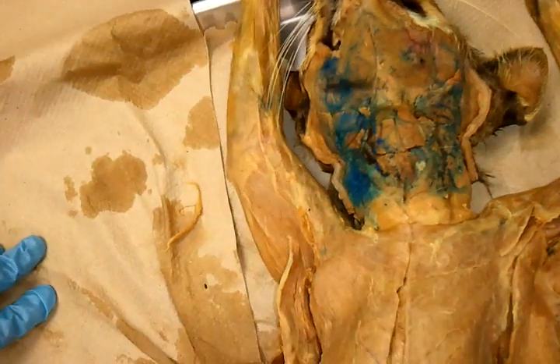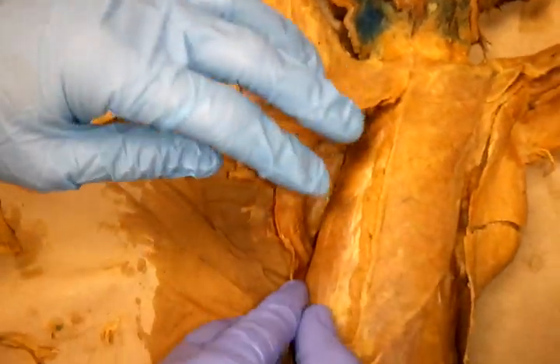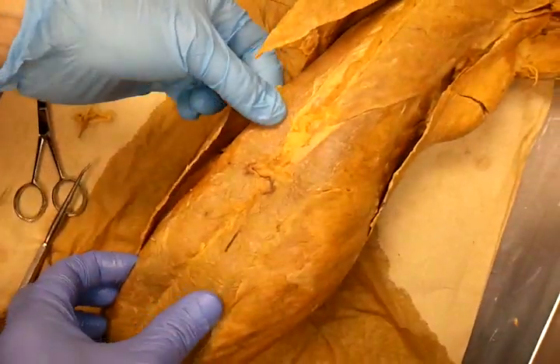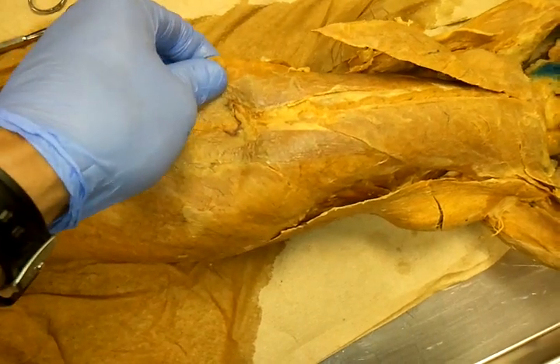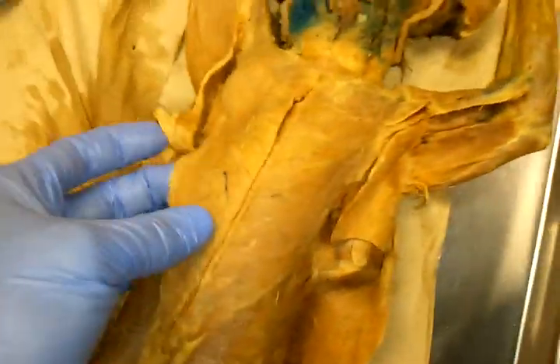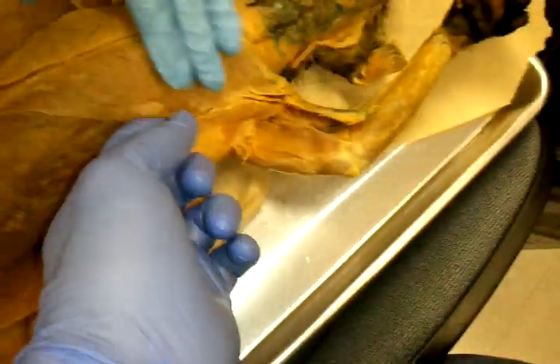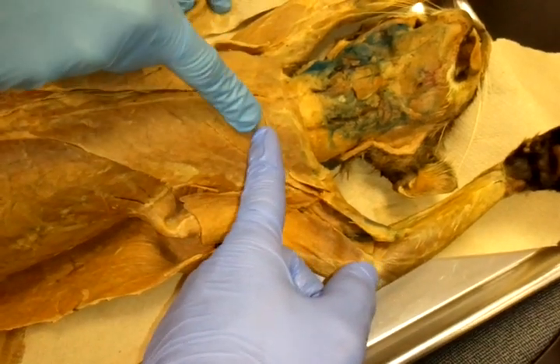This is the rectus abdominis — it goes all the way up here to the fifth rib and the xiphoid process. And this is the pectoralis minor here. Pectoralis minor and pectoralis major.